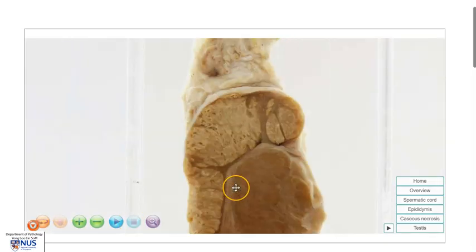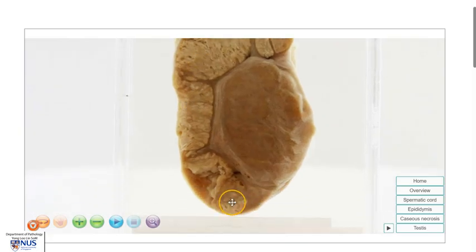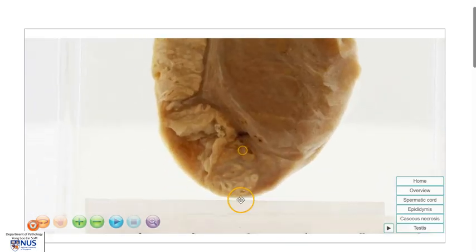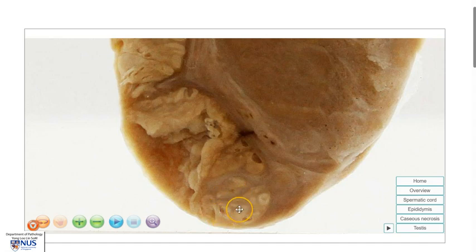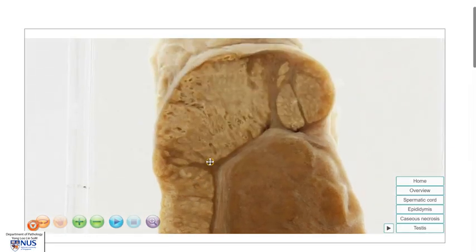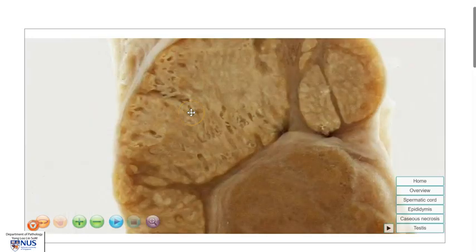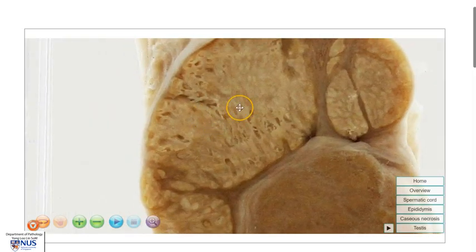Let's take a closer look. The epididymis is enlarged and expanded. Here is a small area where we can still appreciate the normal appearing epididymis. However, in many other areas, it is replaced by this pale yellowish appearance, and this corresponds to necrotizing granulomatous inflammation under the microscope.